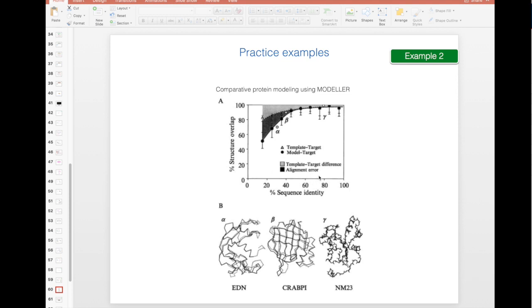If you have around 80% or even 60%, you will get a very nice structure overlap of the final produced model.